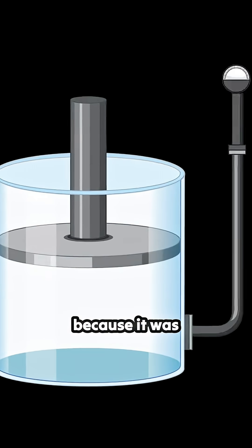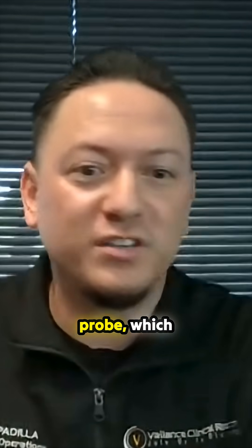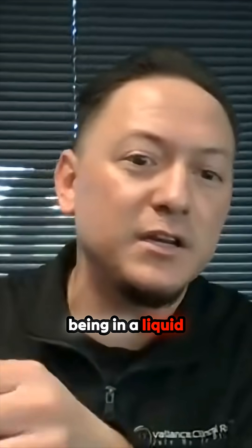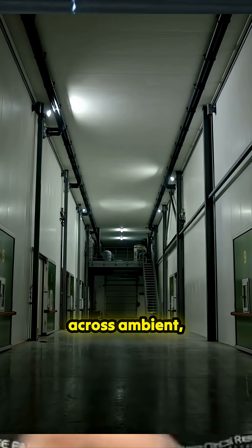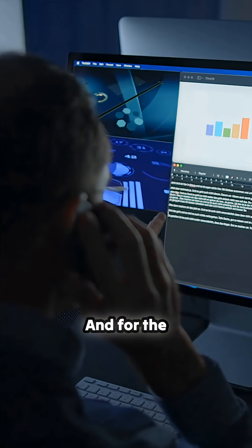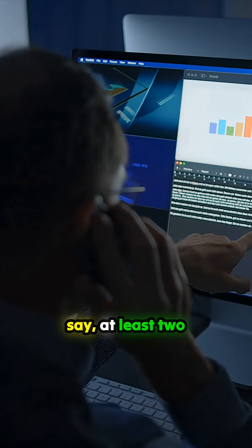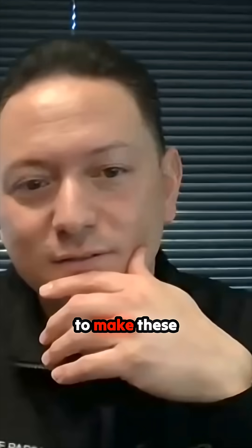I consider them false excursions because it was initially reading just the air around the probe, which escapes right away, versus it being in a liquid solution that kept the temperature in range. And this is across ambient, refrigerated, minus 20, minus 70 or 80. For the past at least two months, we've avoided these false excursions and not having to make these reports.